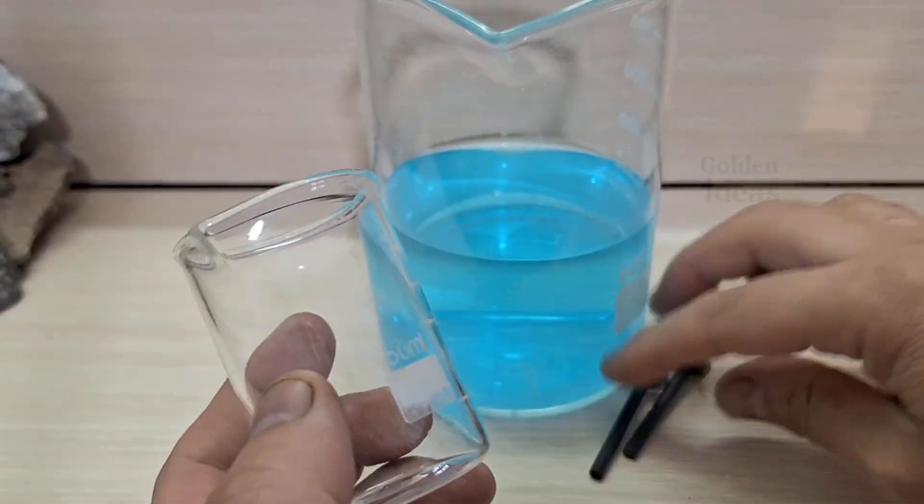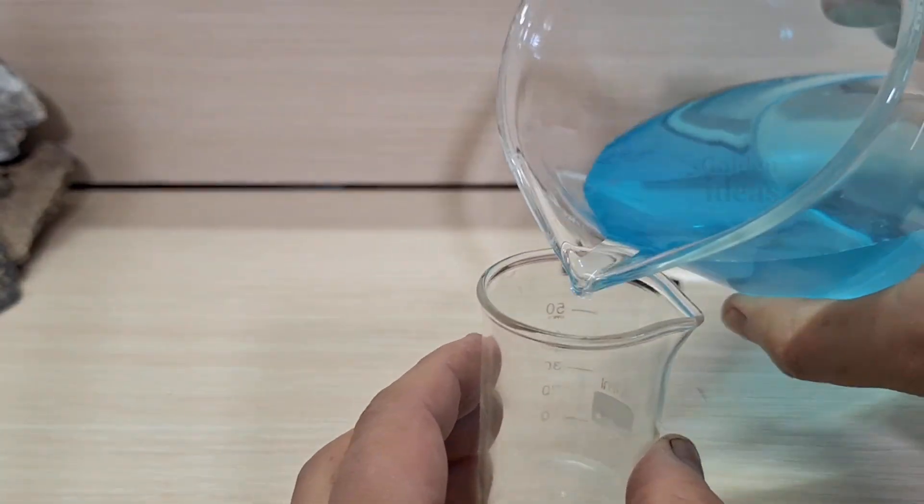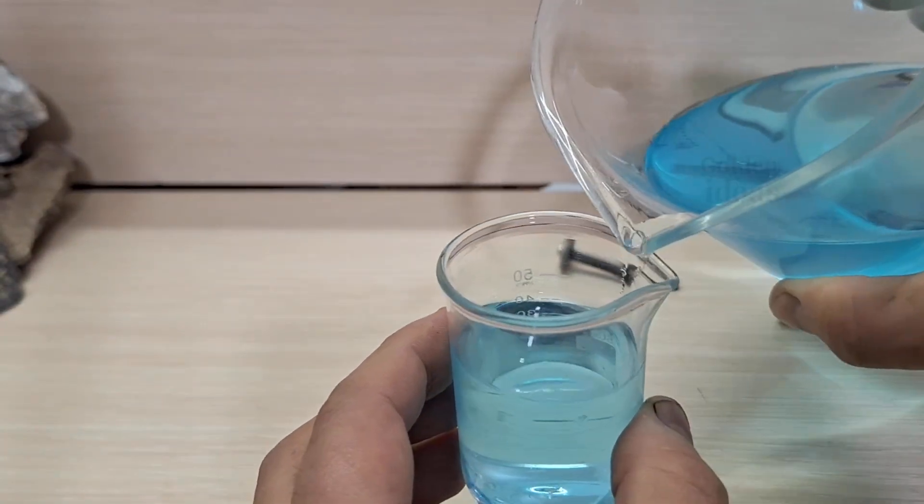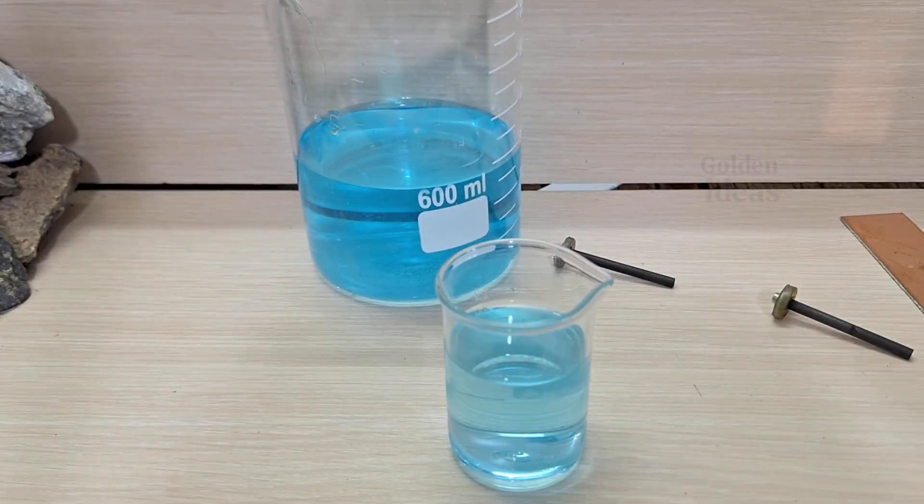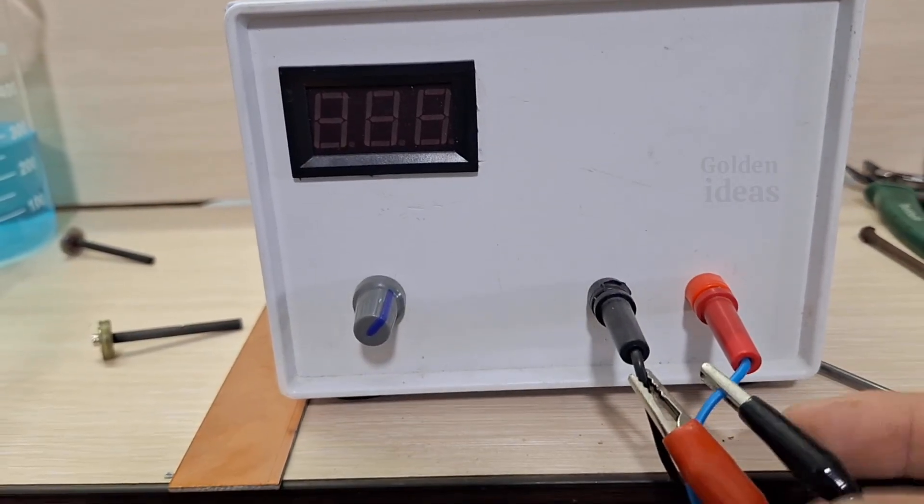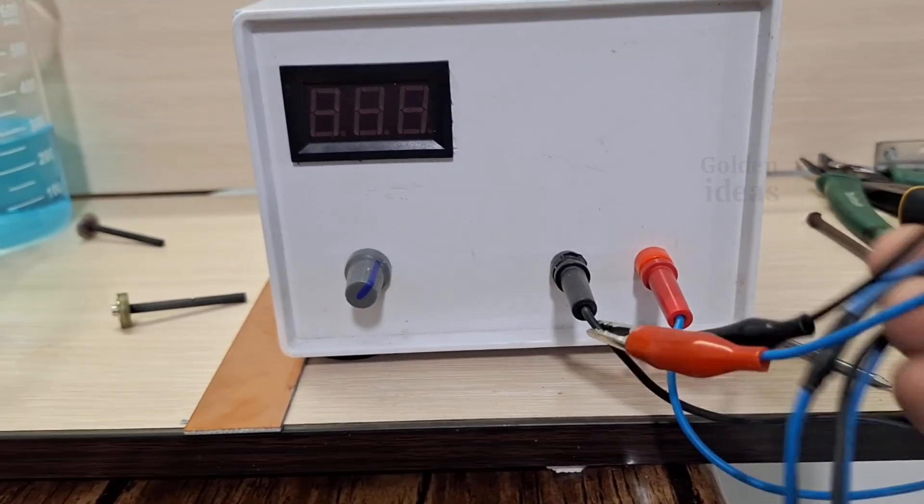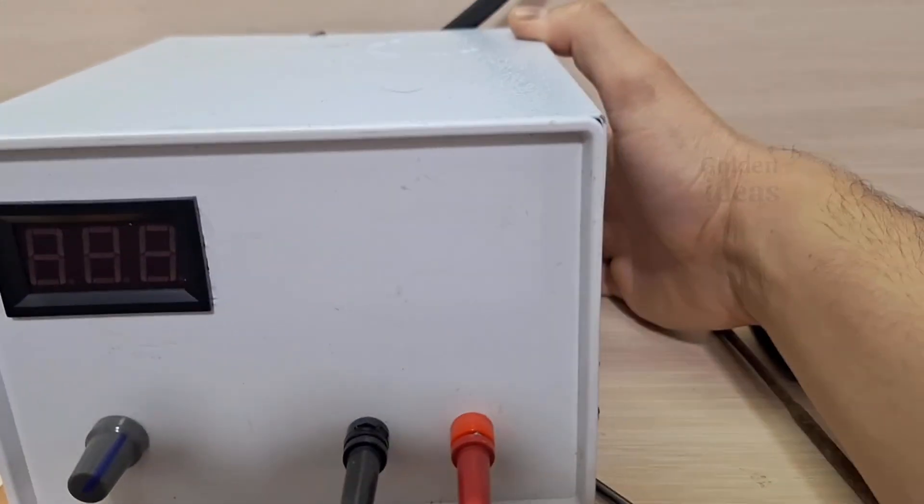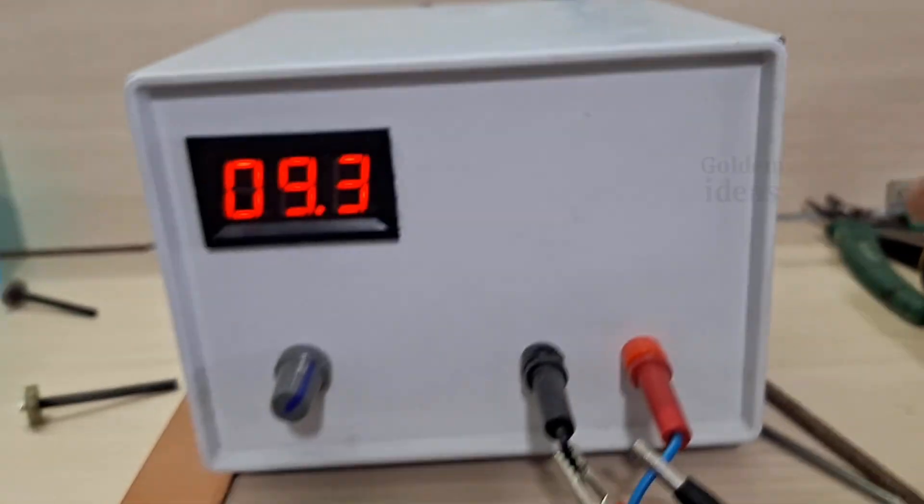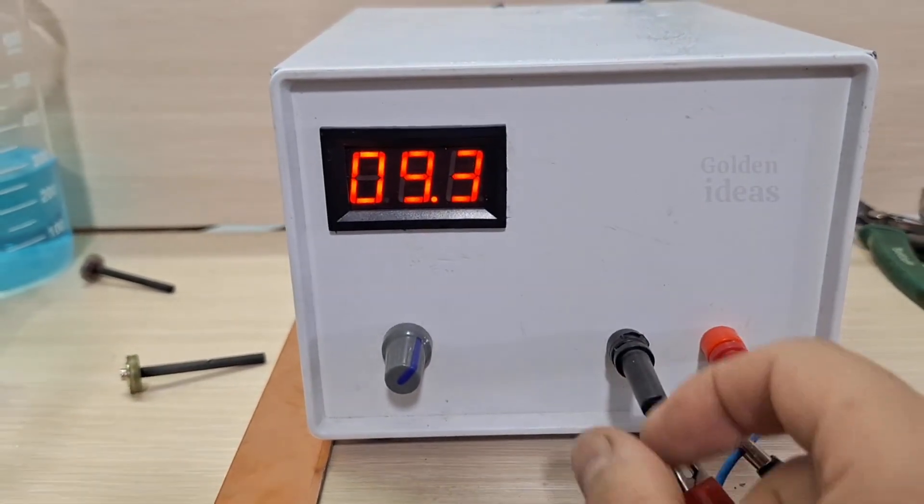Now I'm pouring some of the solution into a smaller beaker so I can place the graphite rods inside. If you have access to larger graphite rods, feel free to use a bigger beaker. You can use a DC power supply like this one, or even a regular battery will work. I've chosen a voltage of 5 volts for this experiment.